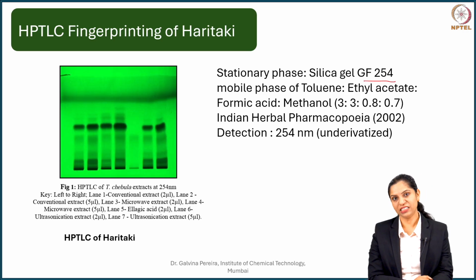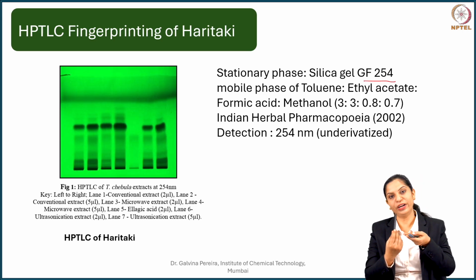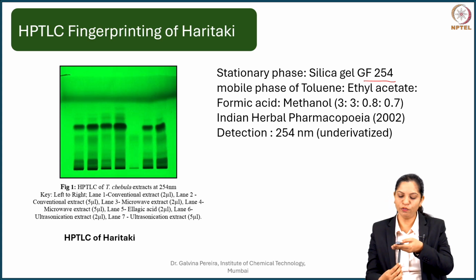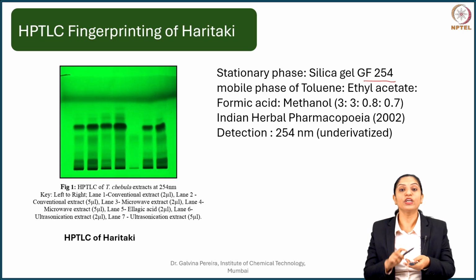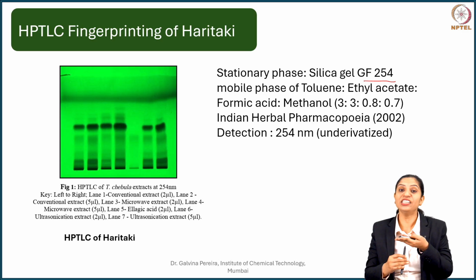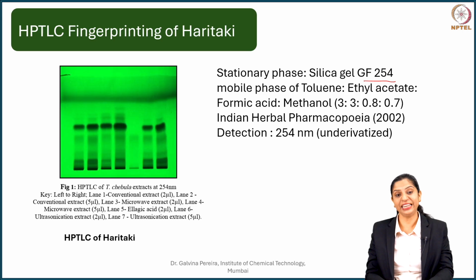Now your tannins being organic molecules, organic molecules do not allow the fluorescence to reach our eyes. They absorb it. So when these molecules absorb it, the fluorescence never reaches the eyes or sensor, and as a result that appears like a black spot. We call it quenching. So most of the organic molecules quench the fluorescence of your plate, and as a result can be seen very easily.